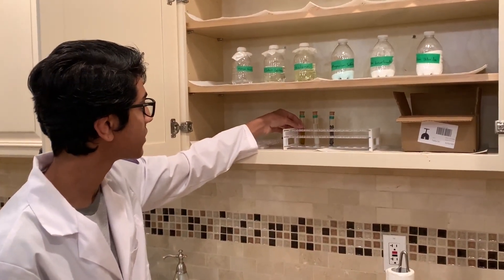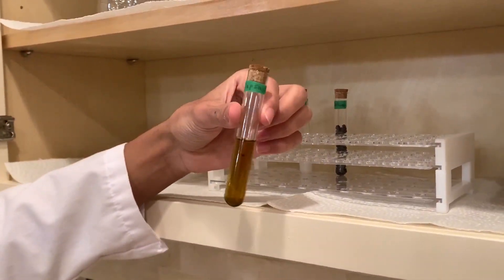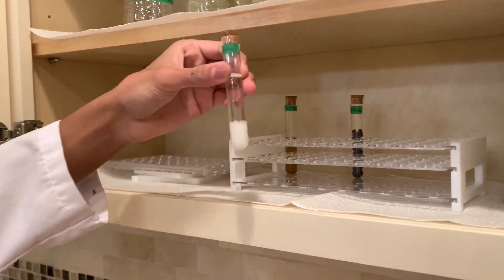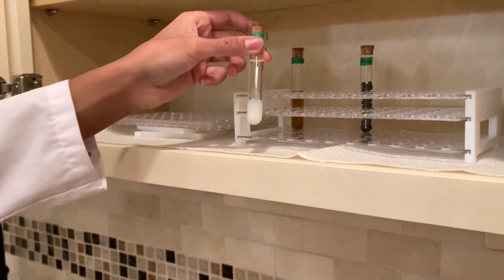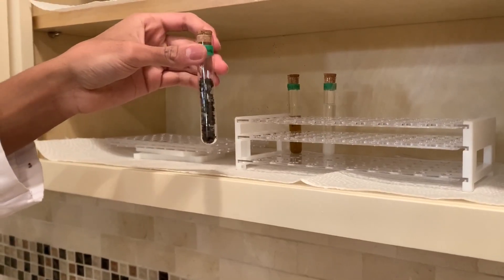Over here I have all the things I've collected throughout my experiments. You guys remember from my first video — I made capsaicin, it's over here. And for my wintergreen video, some methyl salicylate. Some salicylic acid is precipitated at the bottom — I might filter it out further in the future. And for my caffeine video, this one sucked. Not pure at all.